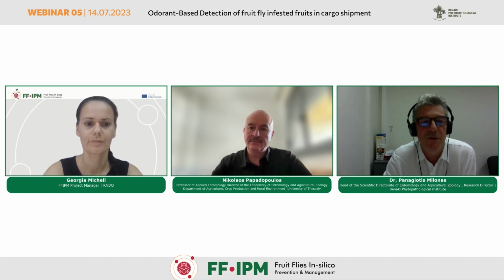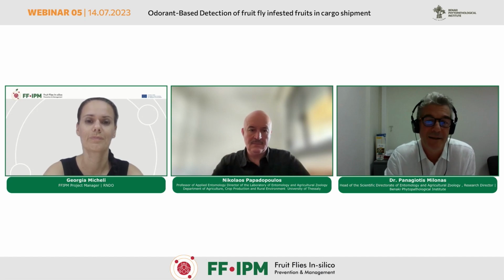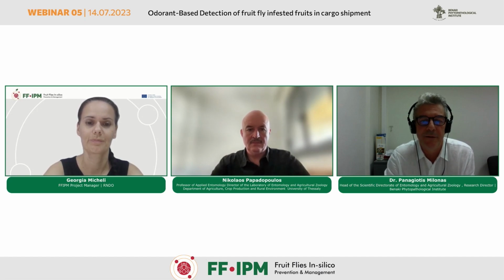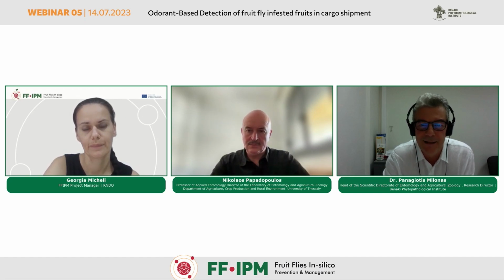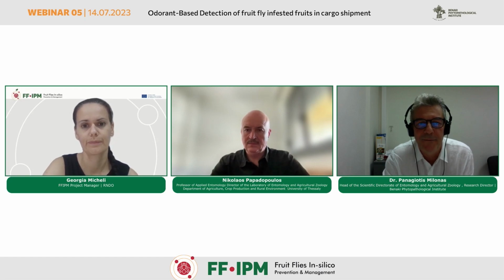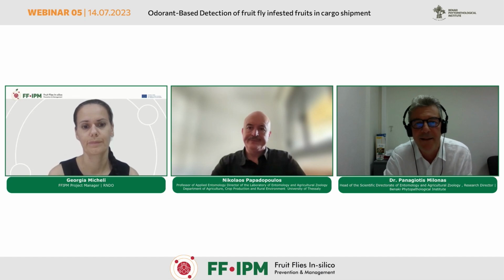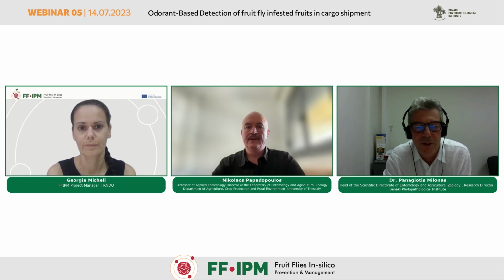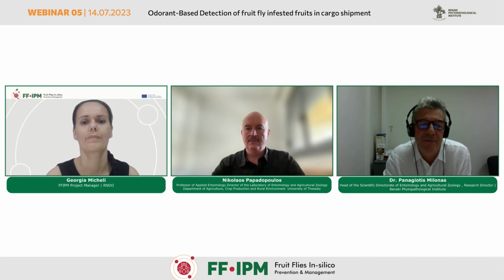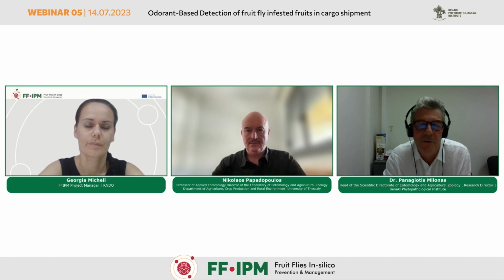I think, Nikos, that this is a question that should be answered not only by a group like us, but also by engineers as well, because what we try to show is that there is indeed variation in the volatiles emitted in the different categories. And ideally, when I started talking about the electronic nose, I mentioned that you need to develop specific biomarkers. And what you use as an electronic nose is for general use. It's not specific. Perhaps the answer to your question is if we can have a specific developed electronic nose with specific sensors that have been structured and developed and constructed to detect this specific group of volatiles.